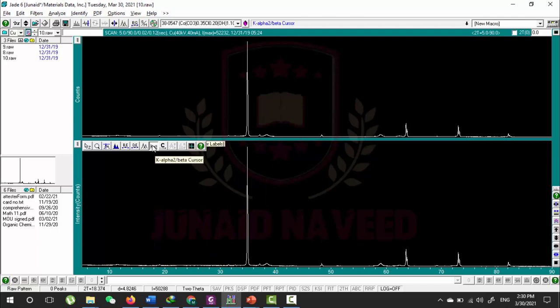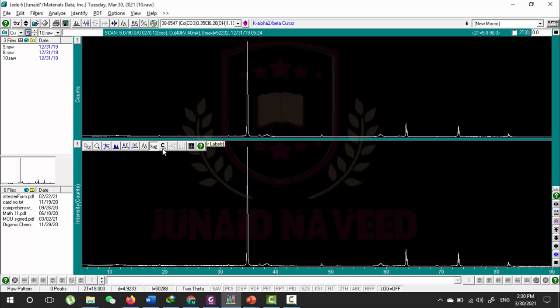I hope you understand the function of this button. This is the Bravais Lattice Cursor and we will discuss this cursor in more details when we discuss this topic particularly in upcoming lectures.